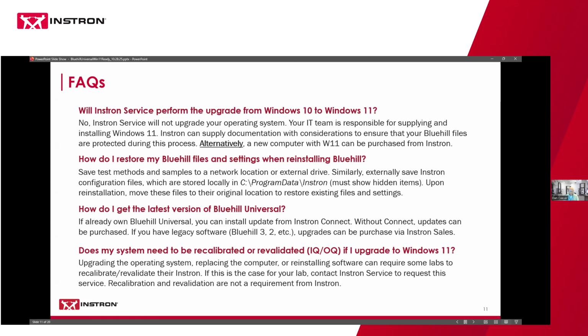The last FAQ that I wanted to add involves the need to recalibrate or revalidate. So does your system need to be recalibrated or revalidated? So it's IQOQ per se, when you are upgrading to Windows 11.